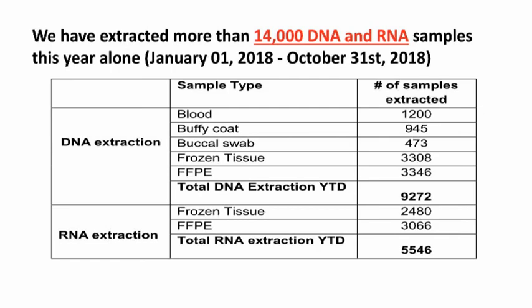We don't always get a normal for every tumor, and in fact, in some cases, the tumor and normal samples are discontinuous with each other when they come in. So these don't always line up on an exact one-to-one basis. That actually turns out to be a reasonably helpful QC step at the very end of the process, because then the normal and matched tumor are separated in batch and separated in time. And then, of course, there's always a check to make sure their genotypes align and everything else. So it works out pretty well.